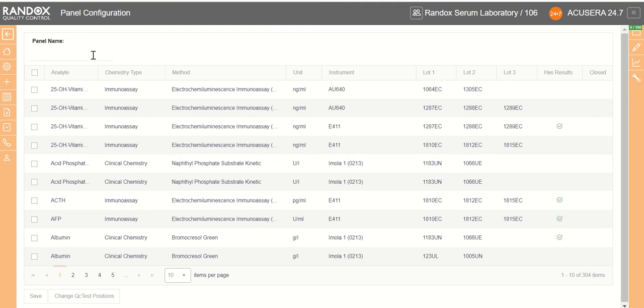You begin by giving your panel a name. We're going to call ours albumin demo and select all the elements.